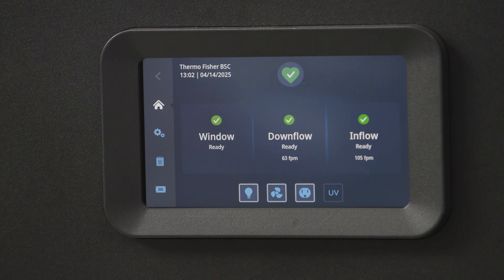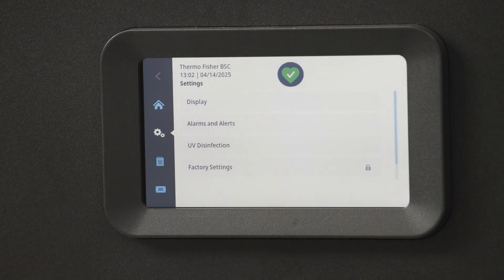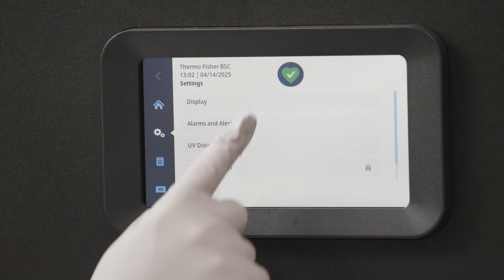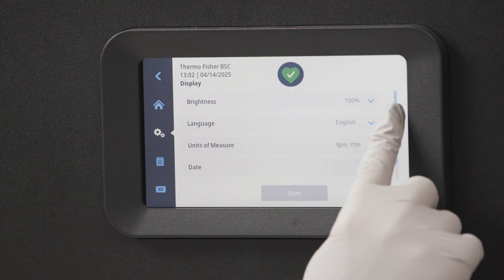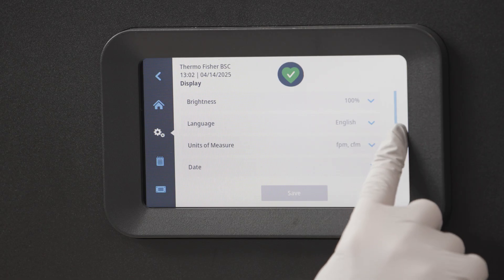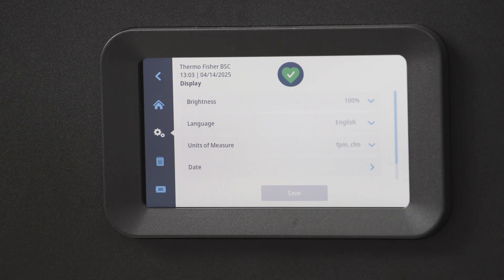Here you'll find the settings icon, which will allow you to adjust many of the cabinet functions. Through the display setting, you can adjust the brightness, language, units of measure, the date, and time.